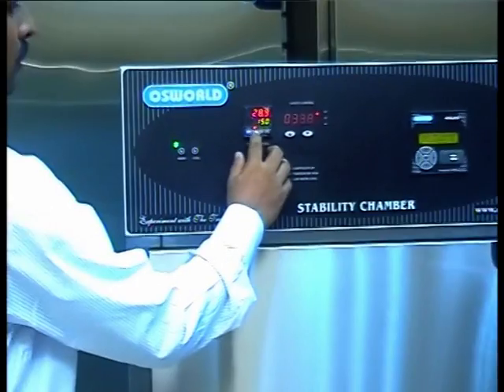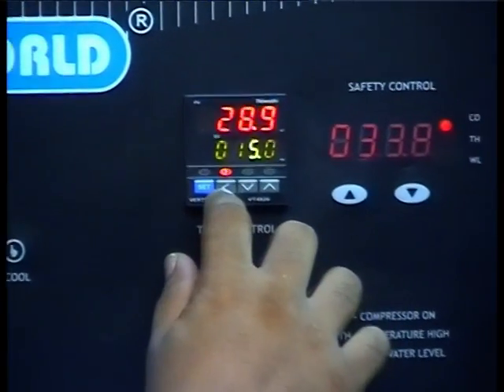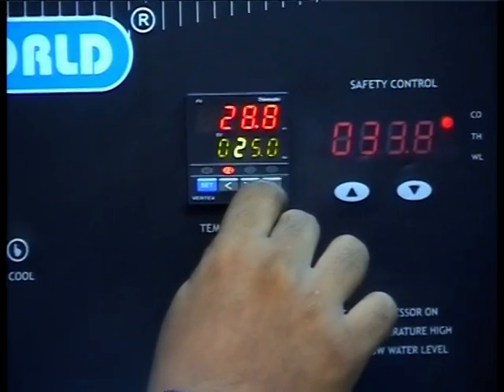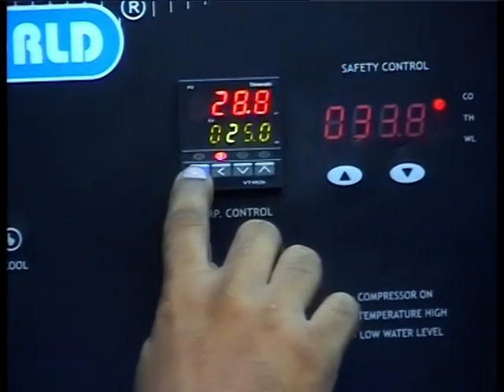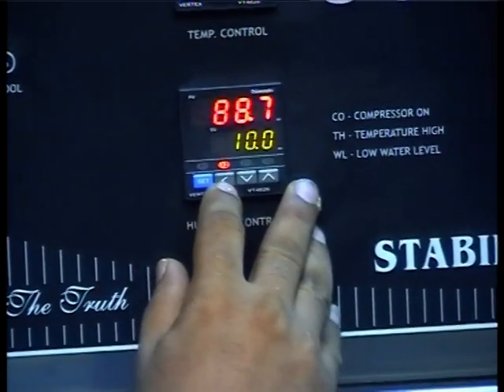This test is conducted to confirm and establish that the temperature system and the humidity system of the stability chamber, including all their associated components, are functioning normally. Firstly, set the temperature controller to 25 degrees Celsius. Set the humidity controller to 60%.